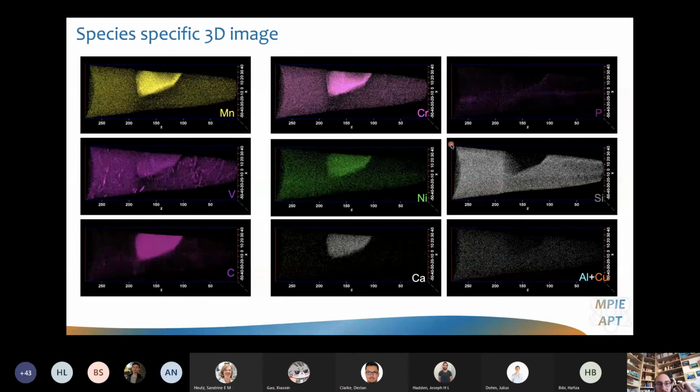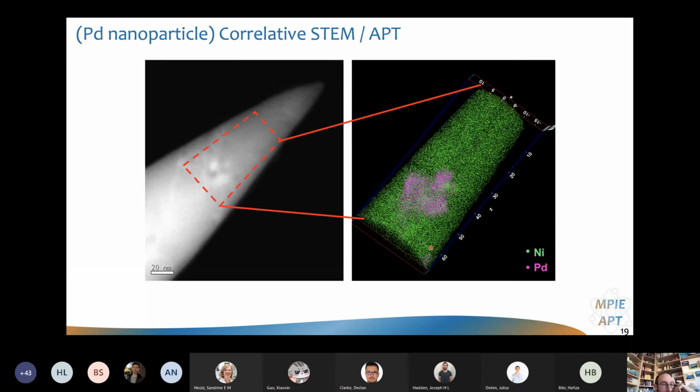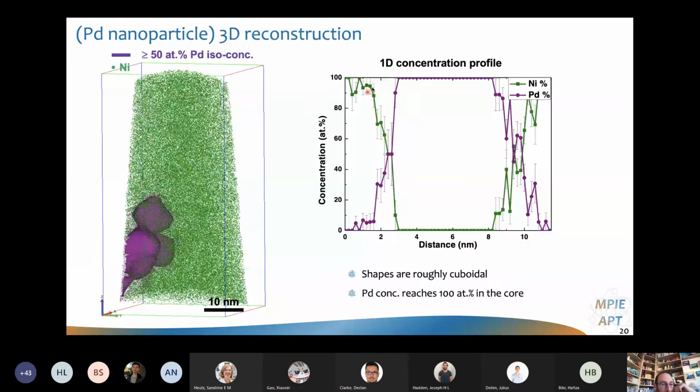So for quite some time, atom probe was basically doing mostly metals. And so it remained a very niche technique. But in the past, maybe 10 to 15 years, it started to open to a lot more different applications. So we now have a pretty active section of the community that's looking at nanoparticles, for example. So here we have embedded the nanoparticles in a metallic matrix. And you can see they're there, and then we can go down to measuring the composition of individual nanoparticles like this. In that case, it's pure palladium, so it's really a bit boring. But still, you can see they've almost maintained this sort of cuboidal shape.